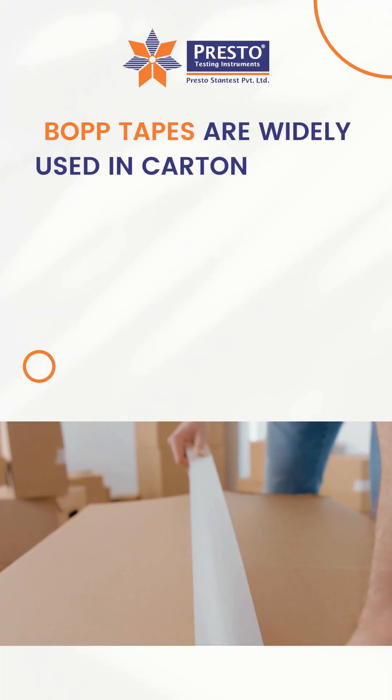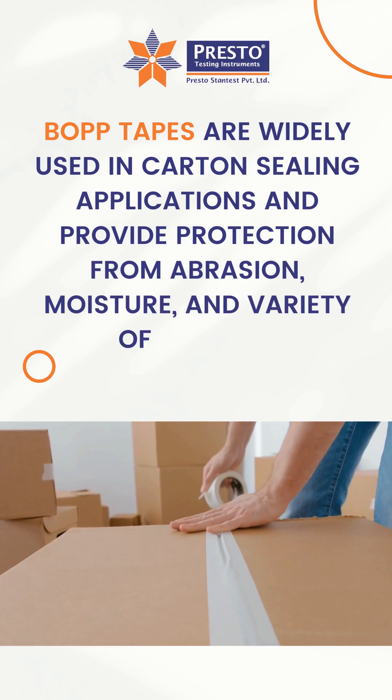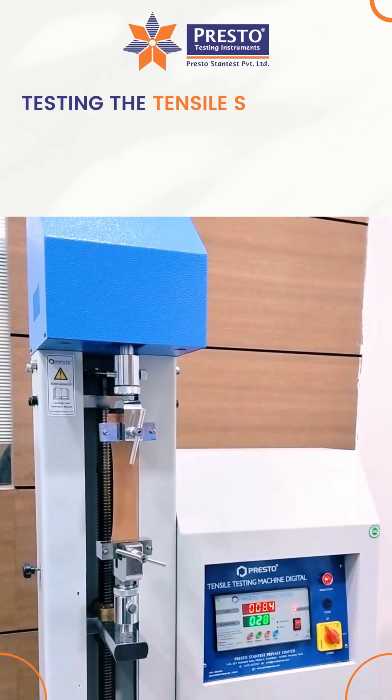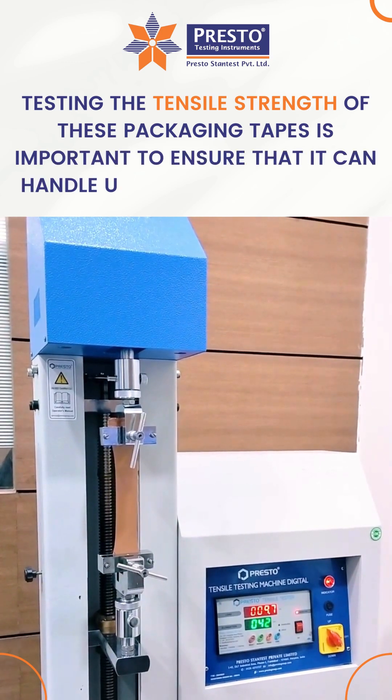BOPP tapes are widely used in carton sealing applications and provide protection from abrasion, moisture, and a variety of factors. Testing the tensile strength of these packaging tapes is important to ensure that it can handle up to its breaking point.